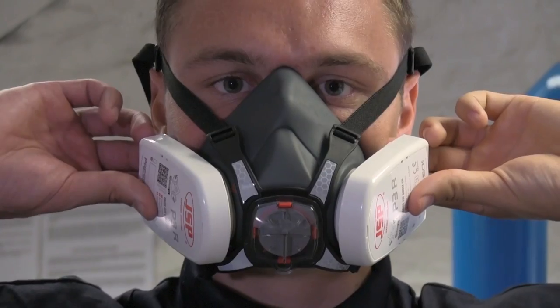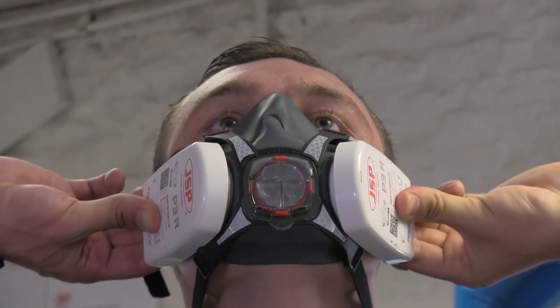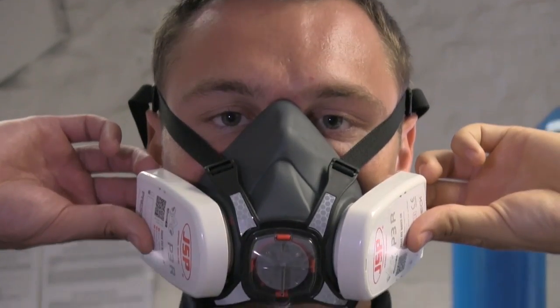Now to make sure that it's actually going to work in the workplace, we need to do a little bit more than just look straight ahead and do the fit check. So what we're going to do is look up and do a check, then look down and do a check.